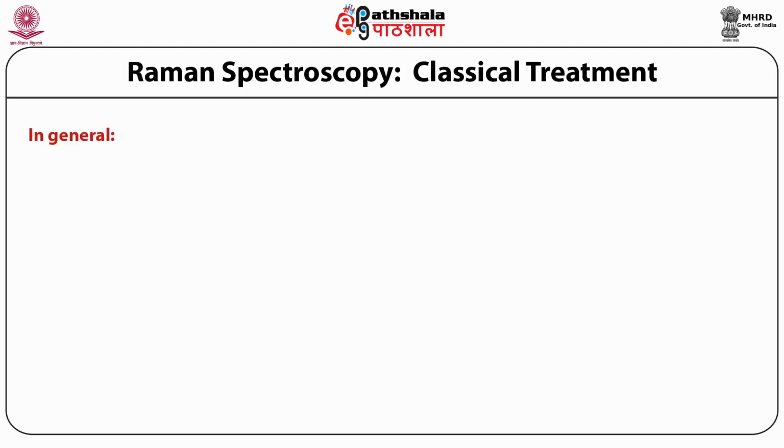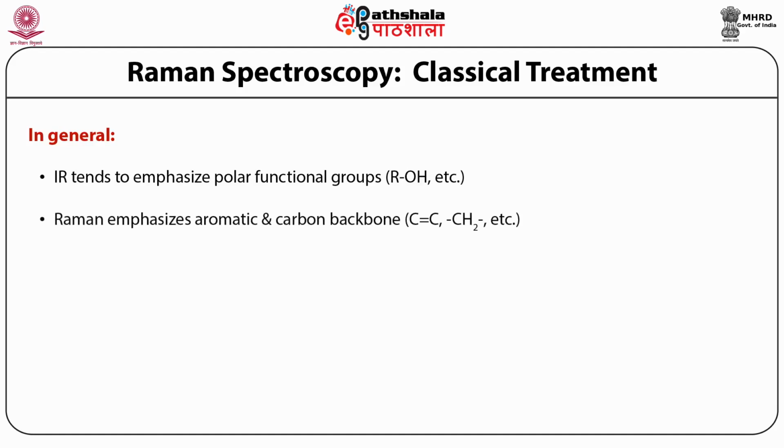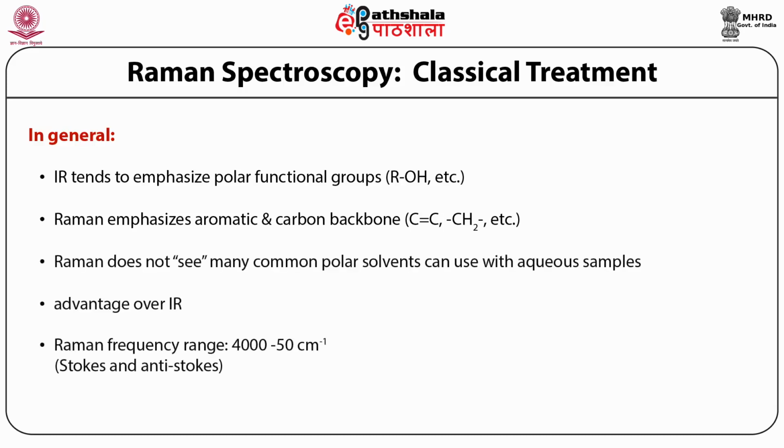In general, IR tends to emphasize polar functional groups, that is ROH or COOH, whereas Raman emphasizes aromatic groups and the carbon backbone, that is C=C, CH2, etc. Raman does not see many common polar solvents and can be used with aqueous samples.